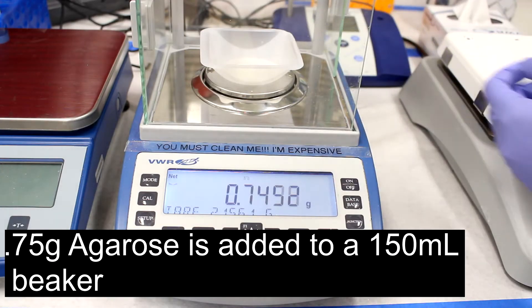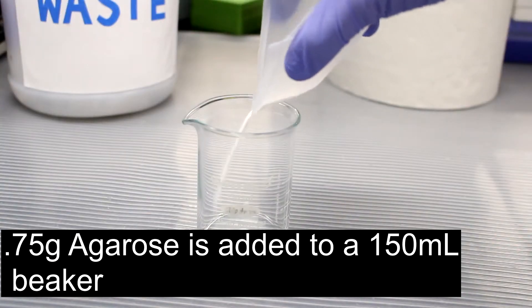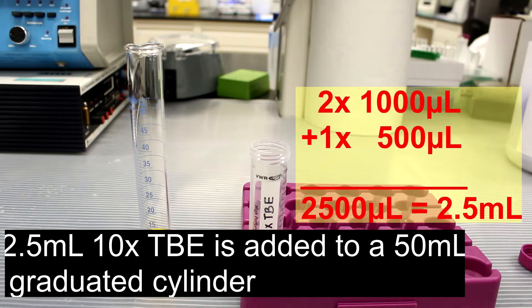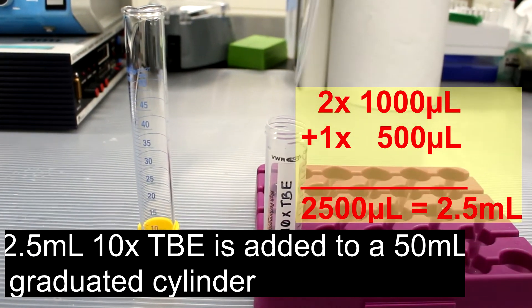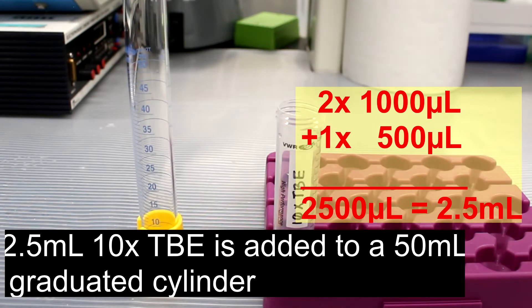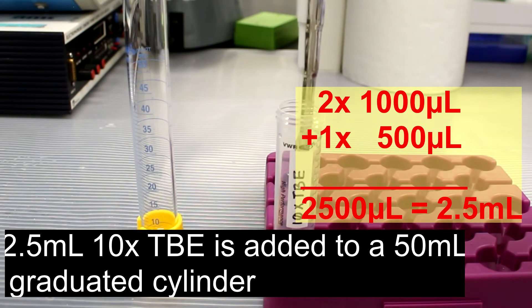To make the agarose gel solution, 0.75 grams of agarose is added to a 250 milliliter beaker. To the graduated cylinder, 2.5 milliliters of 10x TBE is added.